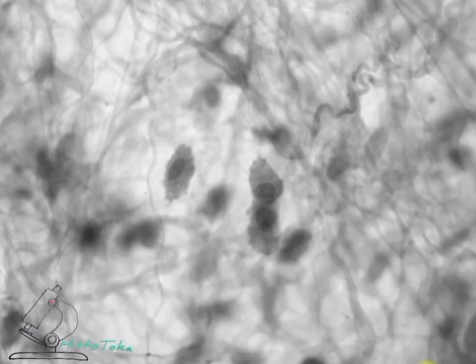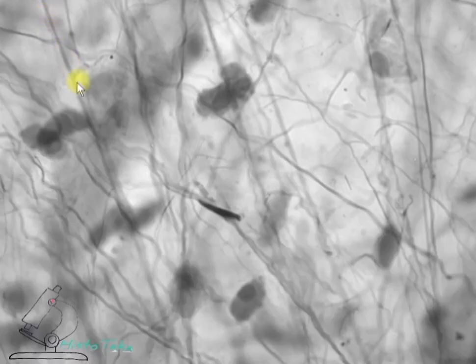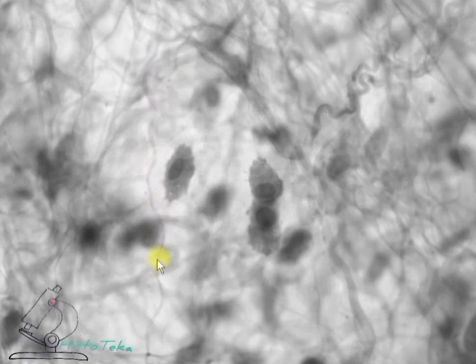There are two types of fibers in loose connective tissue: collagen and elastic. The collagen fibers are tough, flexible, and they resist stretching. Inelastic, they form waved unbranched bundles, and they are called white fibers. On the preparation they are thick, do not branch, and may be straight or slightly convoluted.